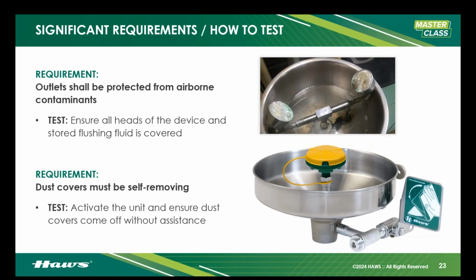Now, outlets have to be protected from airborne contaminants. All that means is we have to have dust covers in place. Otherwise, we're going to get the above example. You're going to get debris, you're going to get buildup, you're going to get lots of stuff that is going to make the equipment work quite poorly in a first aid emergency.